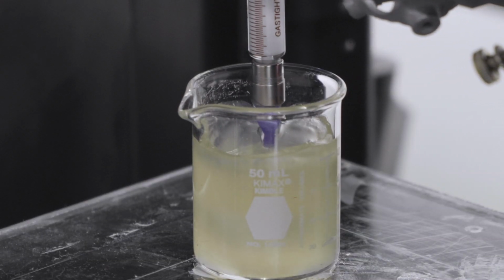Really excited about is developing a technique to 3D print collagen. Collagen is an extremely desirable biomaterial to 3D print with because it makes up literally every single tissue in your body. What makes it so hard to 3D print, however, is that it starts out as a fluid. So if you try and print this in air, it just forms a puddle on your build platform.